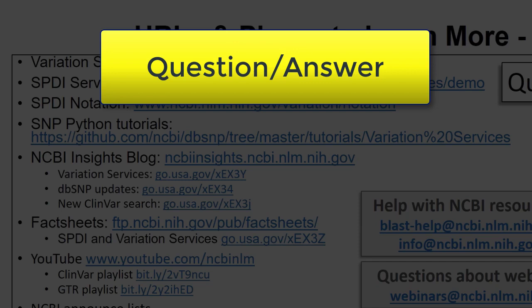Again, we are considering having some of these things run offline, so as I said, you can run your own data set, alignment, stuff like that. Something we're looking at planning in the future is refactoring a lot of these functions to run as a utility offline. Again, if you can just respond to the survey, there's your wish list on there. Okay, now we're going to get a little more into the data.